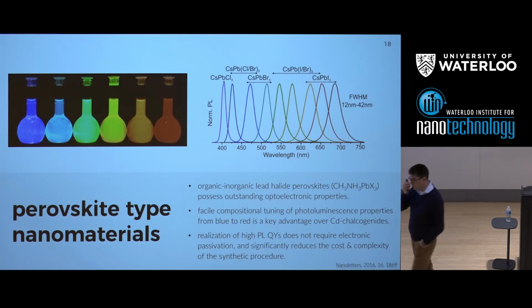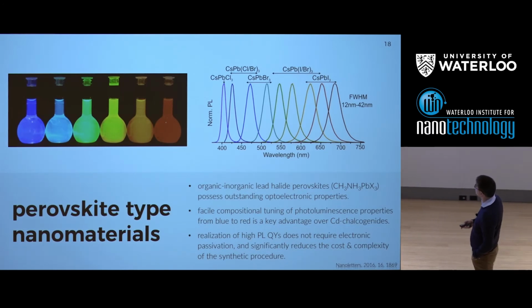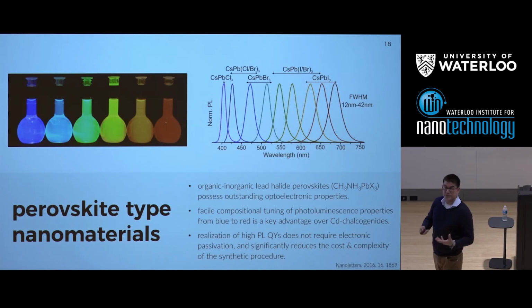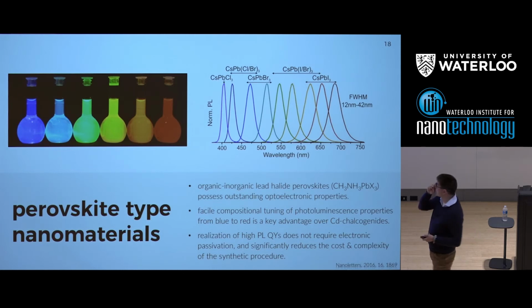So these materials are beautiful. The quantum yields very close to unity. The radiative lifetimes are up to about 30 nanoseconds. So these are hugely important materials. And we realized that by using, again, very simple microfluidics, we could start to do things that would be very, very difficult to do on the macro scale.